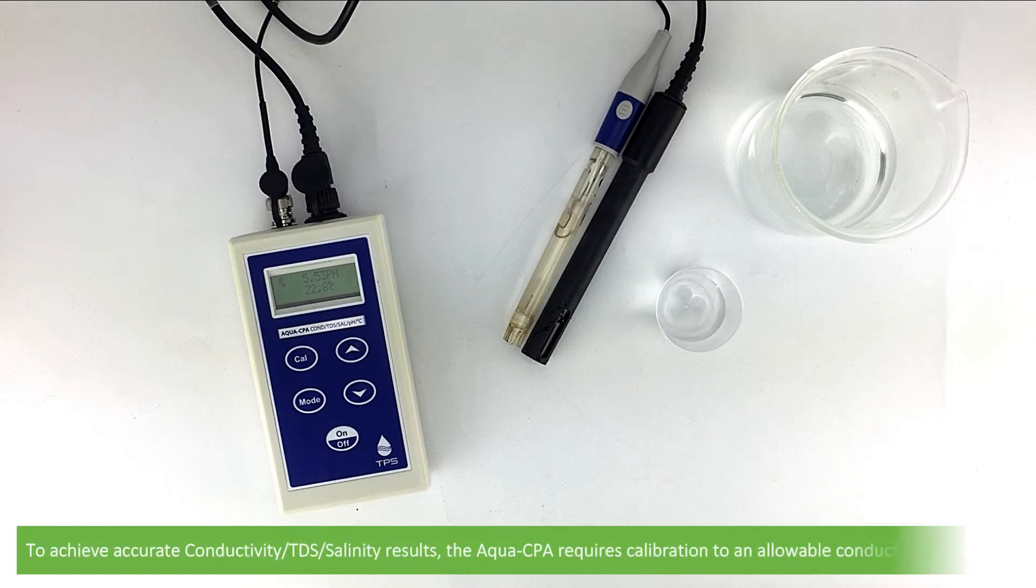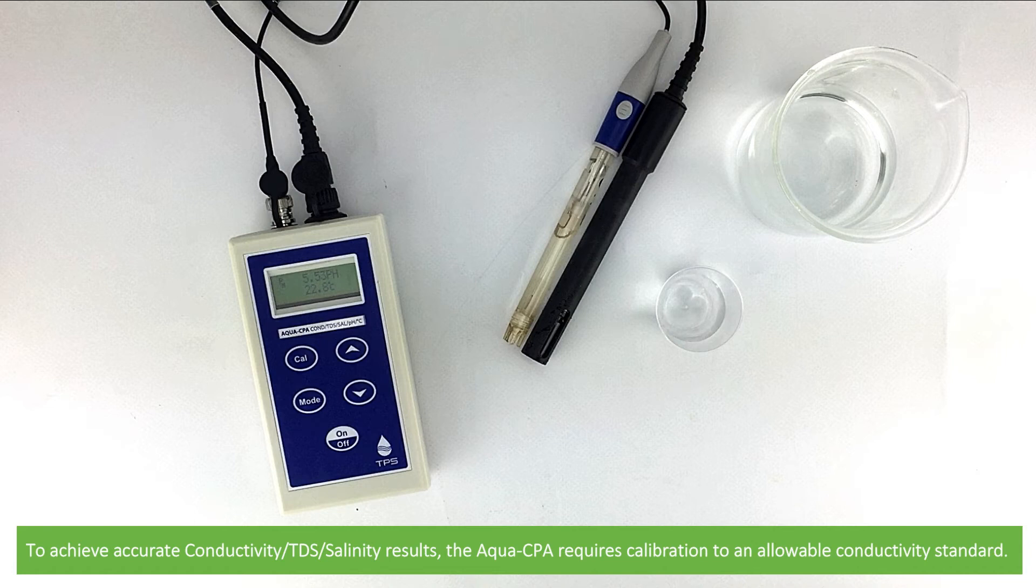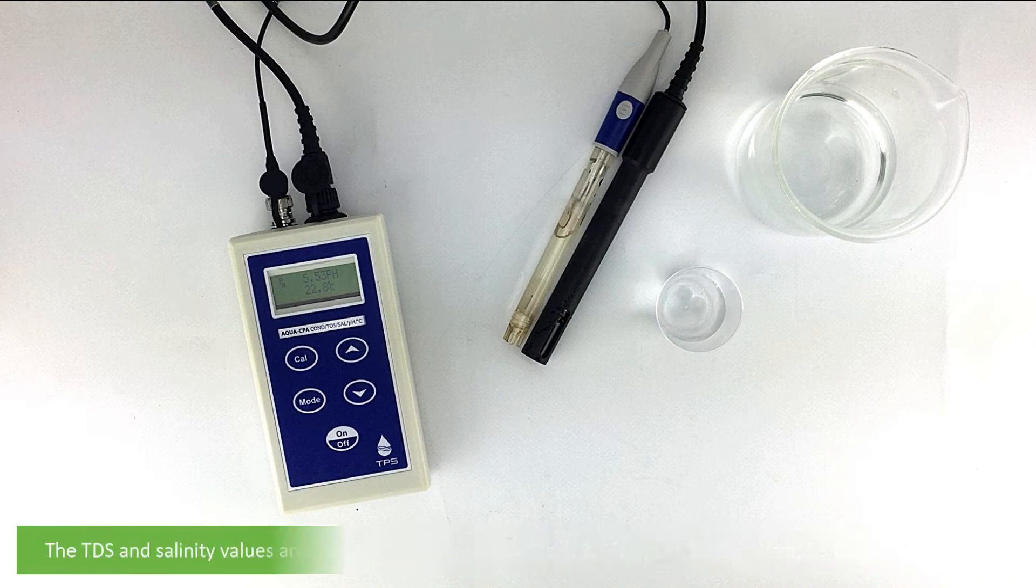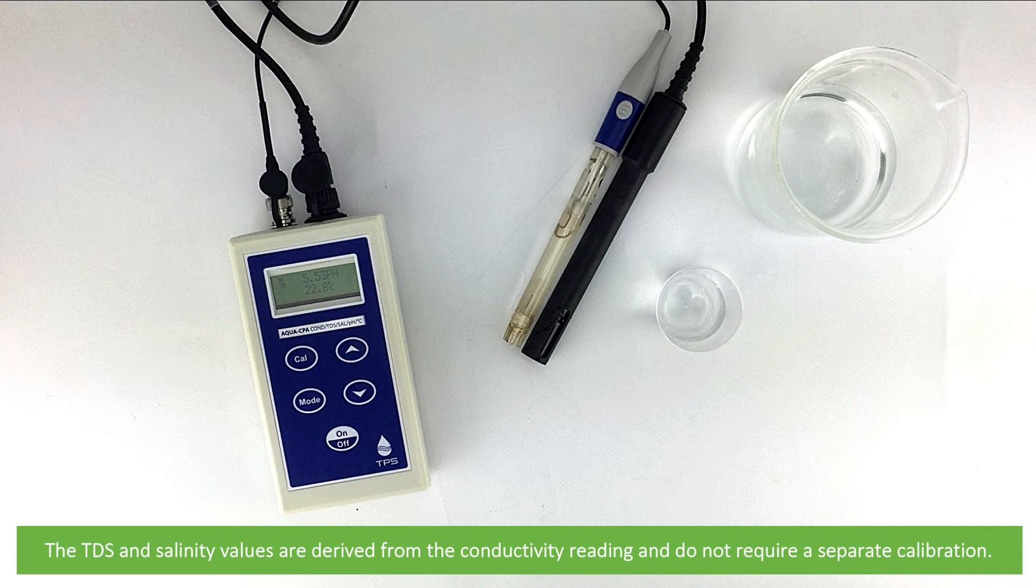To achieve accurate conductivity, TDS and salinity results, the Aqua CPA requires calibration to an allowable conductivity standard. The allowable standards are 150 and 1413 microsiemens per centimetre and 2.76, 12.88 and 58 millisiemens per centimetre.